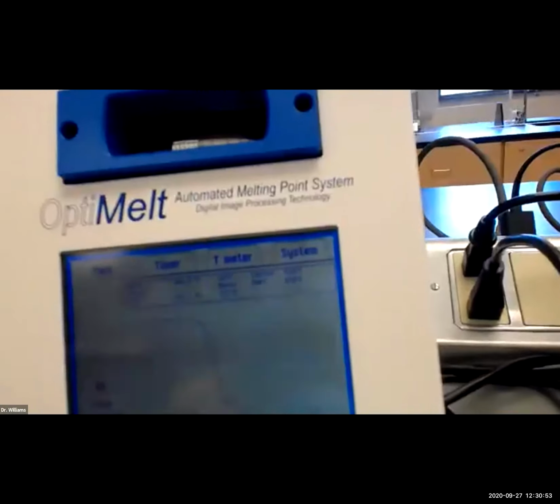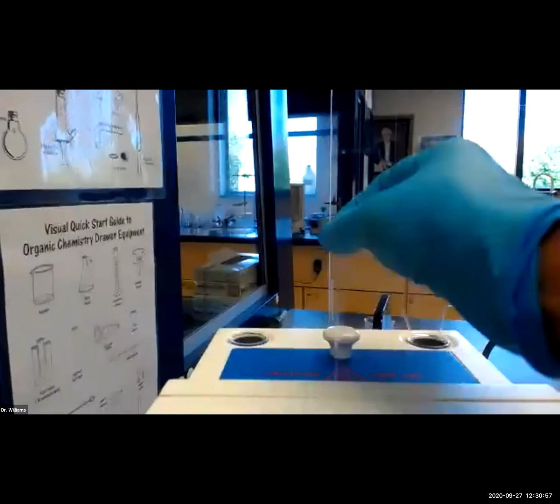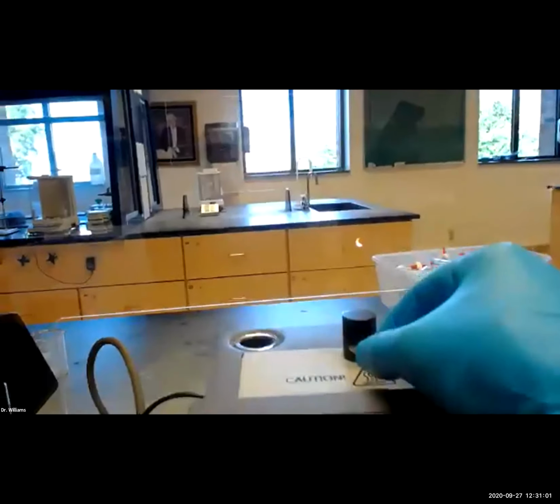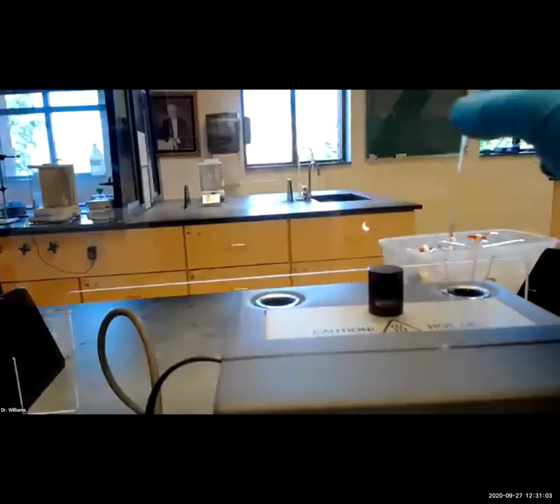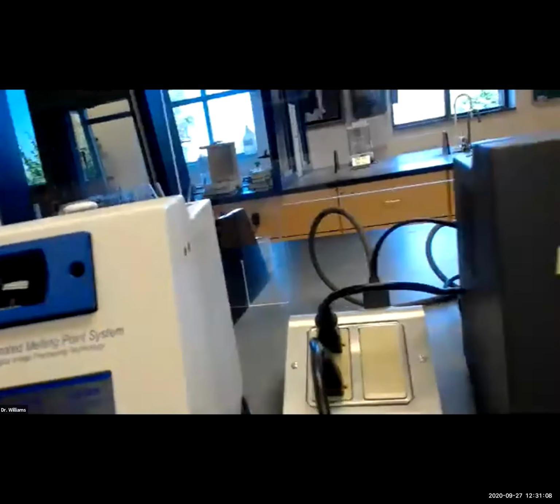Okay, well, we're almost done. You don't want to leave your melting point tube in there, right? So this goes out into the waste. So just be careful when you take this out so it doesn't snap off. Gently remove it into the waste, and it's all set for the next student. All right.